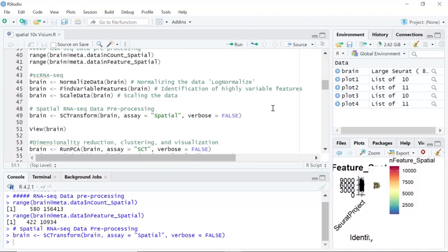I finished the step of data preprocessing using the SCTransform function. Now let's have a look at the data set.